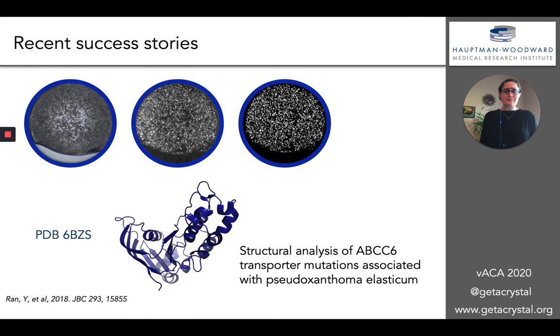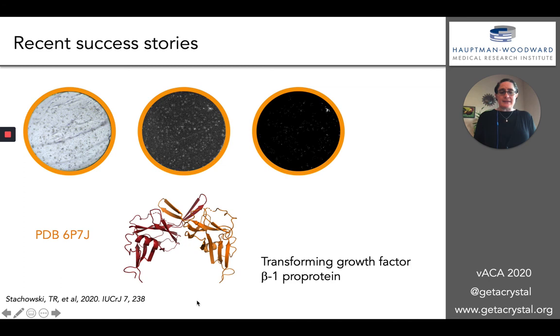So I just want to leave you with a couple of success stories for some of the users who have sent us samples. This is actually a particular structure of a transporter that is important in a particular disease. And again, bright field, UV, TPF, and SHG shows these very small but positive crystal hits that were the initial conditions that went on to enable solving this particular crystal structure. And that was from the Thibodeau lab at the University of Pittsburgh.